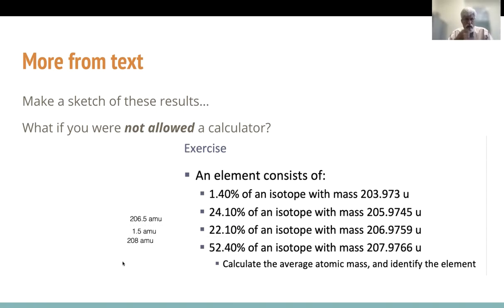All right, so because this represents 50% roughly, and this represents 50% very roughly, I'm going to take this number and divide it by 2. 1.5 divided by 2 equals 0.75. So halfway between 206.5 and 208, I need to add this 0.75 to get there.